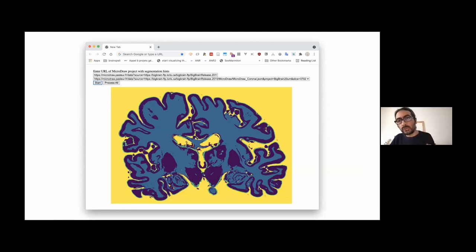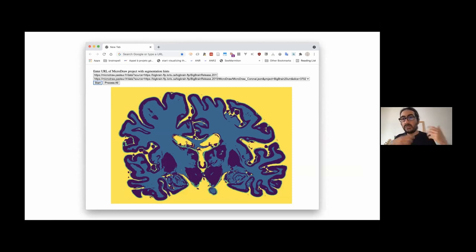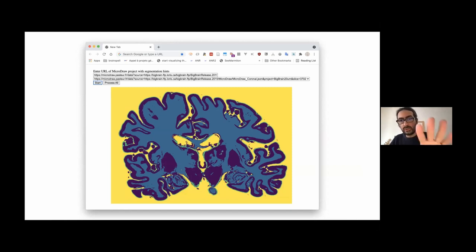If you are not happy with the segmentation, you can go back to MicroDraw in real time, change it, add more hints in places where it's not working very nicely, and rerun the analysis. It takes, in total, about 20 seconds.